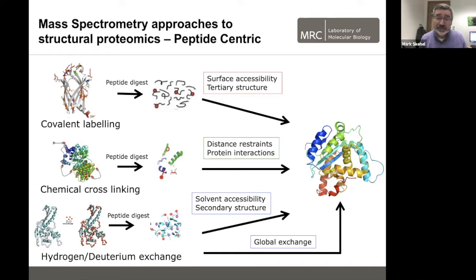So you can do that specifically with things like N-ethylmaleimide or something like that. Or there's a technique that's gaining a little bit of a following, FPOP, this fast photo-oxidation of proteins. There are a lot of people having a go at that now. It's not quite as easy as they might make it sound, but a lot of people are using that.